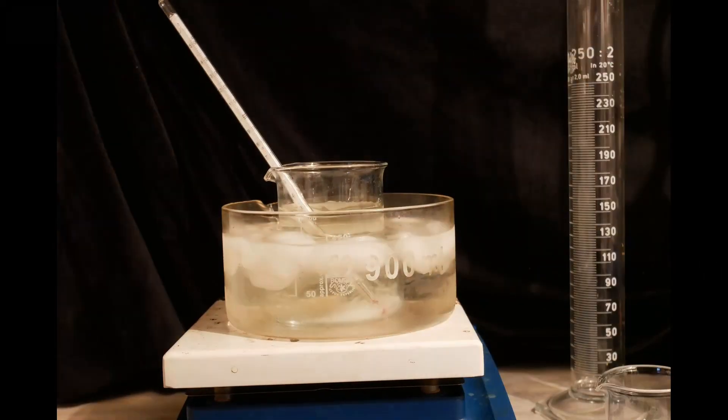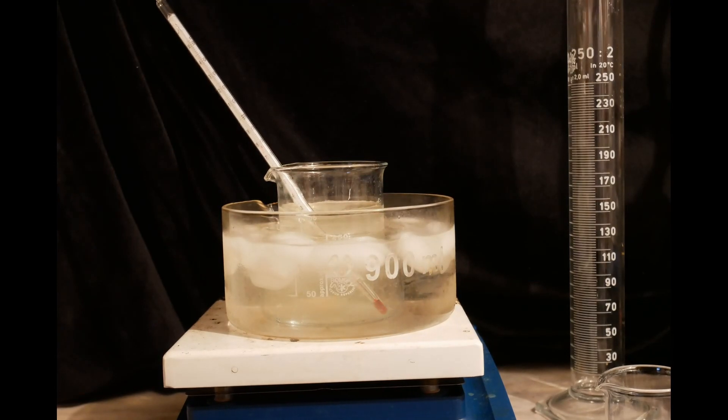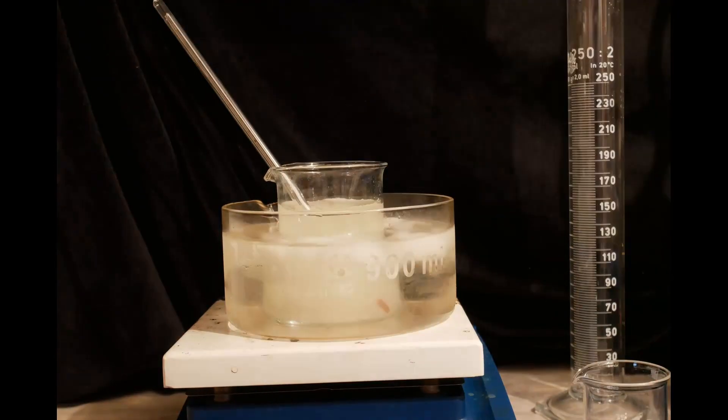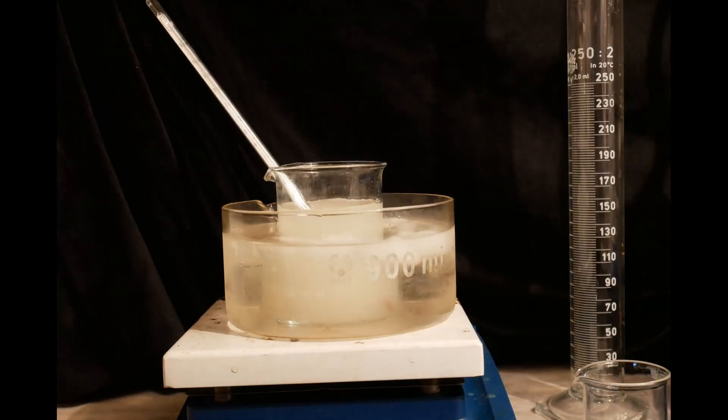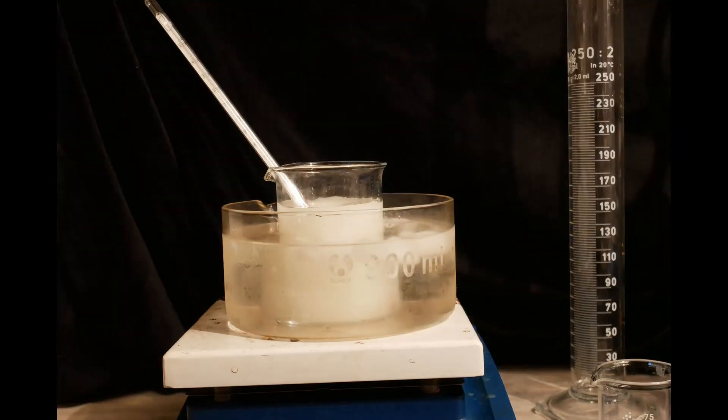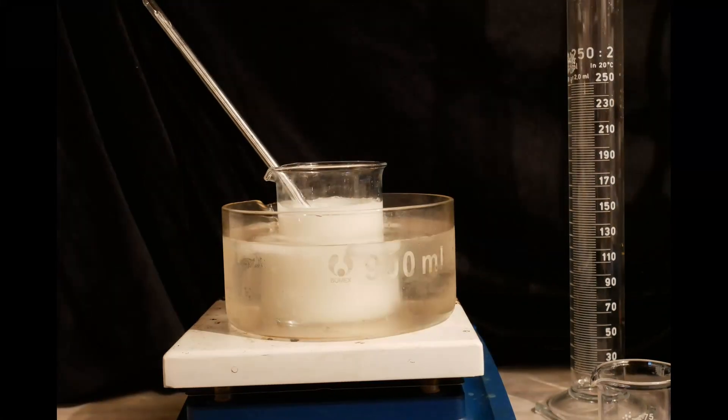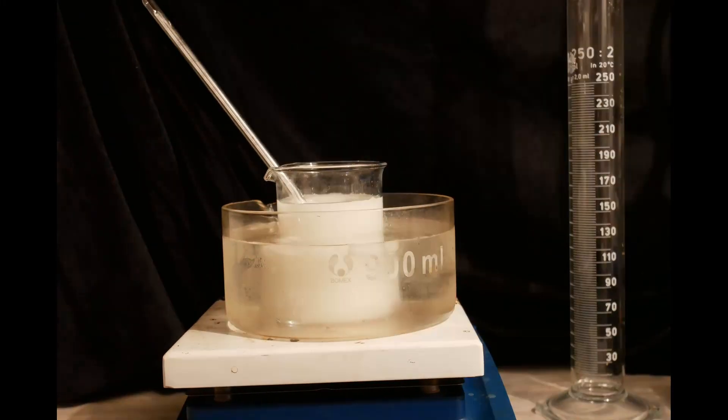The hypochlorite is cooled in an ice bath to 0 degrees and 34 grams of sodium hydroxide are dissolved in the solution. The temperature is kept below 20 degrees to prevent decomposition of the hypochlorite. Some white precipitate is falling out of the solution, which is probably sodium chloride.